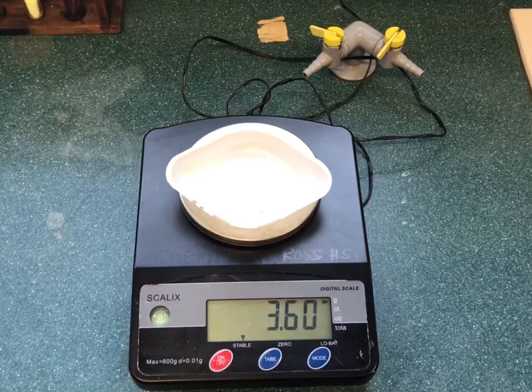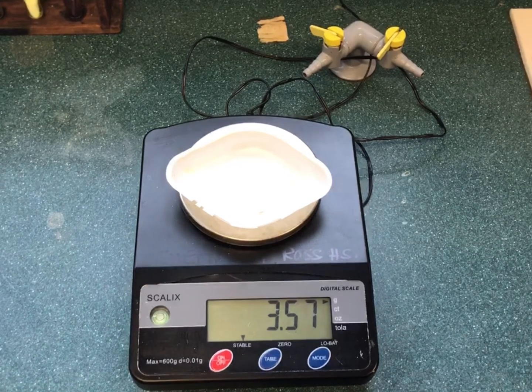The required mass of solid is measured out using a balance and the mass noted. If the solid was not measured in a beaker, it must first be transferred.